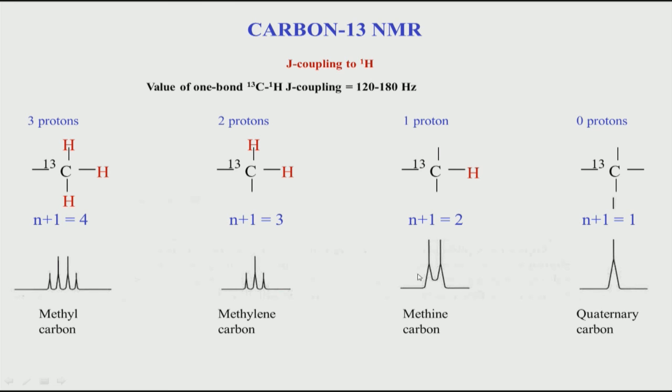But if you see, the number of peaks has increased. It has 4 peaks instead of 1, and remember the couplings are large here. So, when a coupling is large, the separation between these multiplets is also large. That means it occupies a large range of chemical shift, unlike protons. In protons they occupy a small range because the couplings are small, so they are all bunched up together. But in carbon the separation is more because the J coupling is more, and therefore it can create a problem of overlap, meaning 2 neighboring carbon atoms will start having overlap.